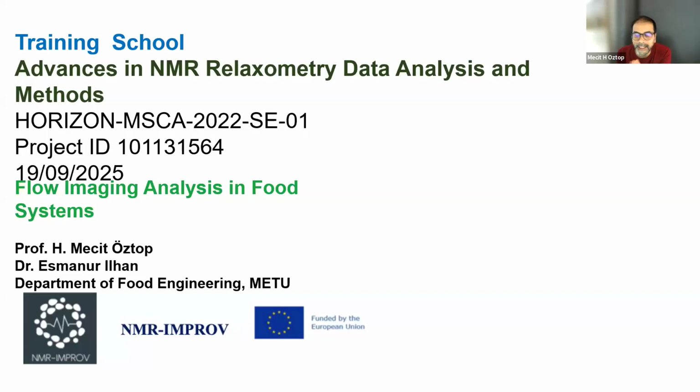Okay. All right. So welcome, you all. Today I'm going to talk about a different topic which we have not addressed in previous seminars or training schools. For some time in our lab, we have been working with a benchtop MRI system, and we are converting that to a flow imaging system. And today I'm going to talk about how we finally achieved the data analysis part for flow images.